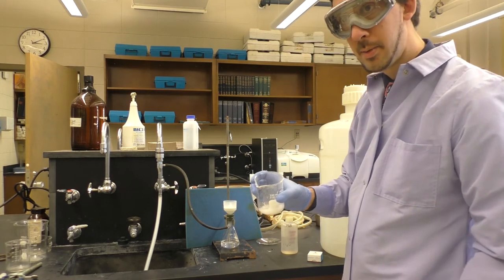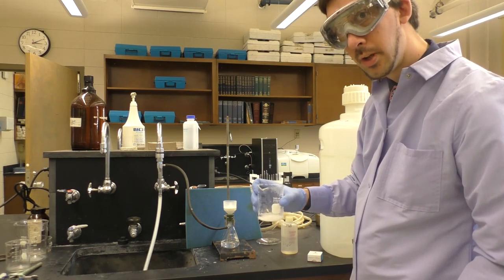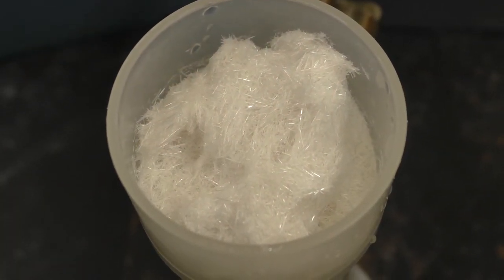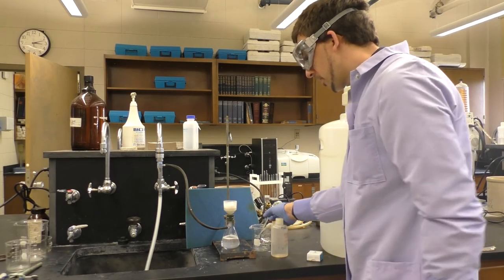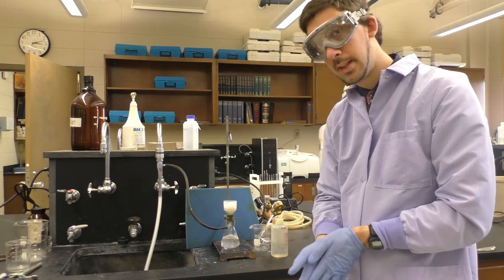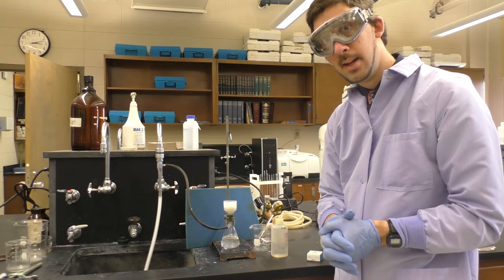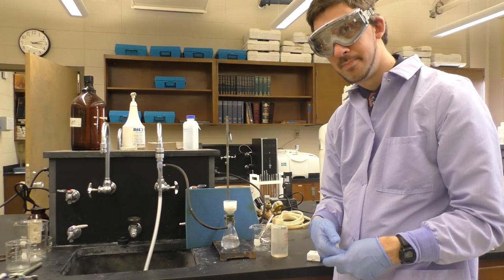We'll grab a spatula real quick, scrape these onto the filter, and then rinse the whole system with some distilled water. Now we'll let air pull through the system for a while to dry those crystals. Then we'll collect them and weigh a beaker, collect those, and put them in the oven for a while to dry, and then get a final mass, a melting point, and NMR for the purified material.